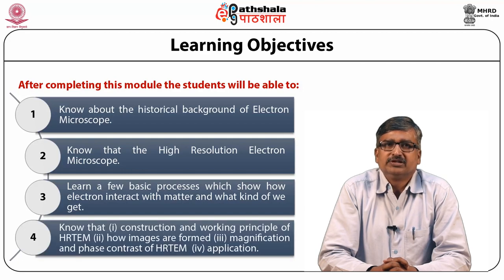We will also know the construction and working of TEM, how images are formed, how this phase contrast will develop, and their application.